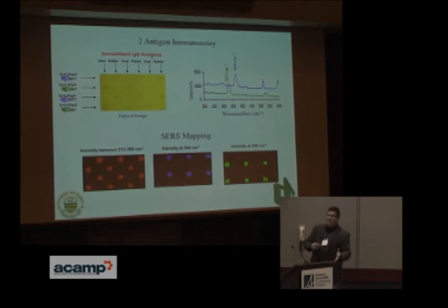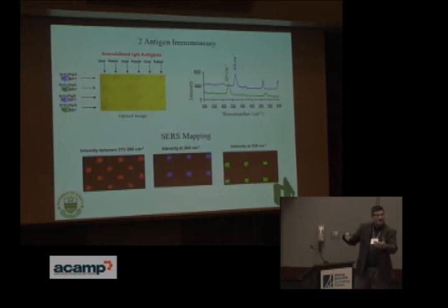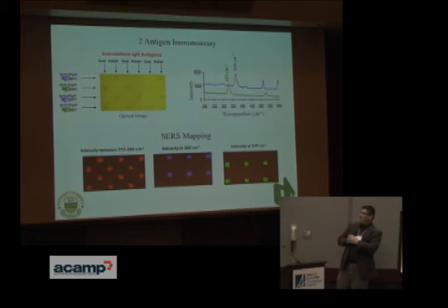And then we collect a single map of the surface, and if we plot all the intensity, we see all the spots. If we plot the intensity of a band that is specific to one of our labels, we see one series of spots. And if we plot the intensity of the band corresponding to the other label, we see the other series. And so we're detecting both of these antigens on the same chip. And obviously you can see where this can be extended. We've actually done up to 6 right now, but I don't have that data in this talk.